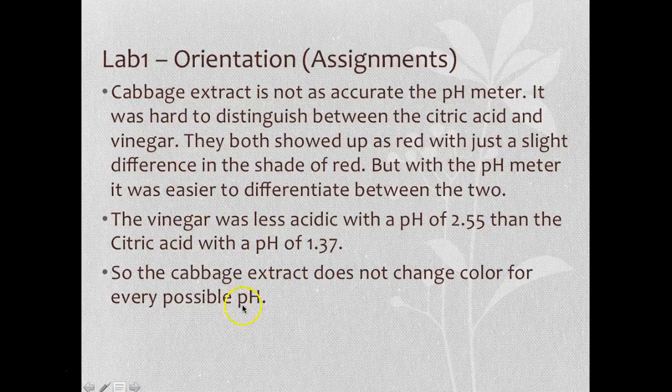Excuse me. So the cabbage extract is not as accurate as the pH meter. This is because there's no number associated with it. You're simply looking at colors, and so it's not a very accurate way of determining which acid could be stronger or which acid weaker or which base stronger and which base is weaker.